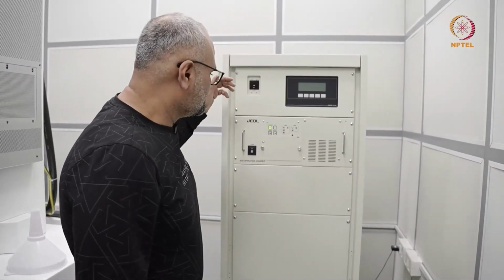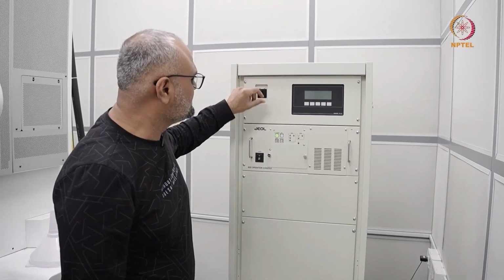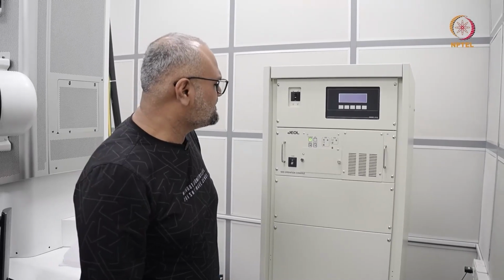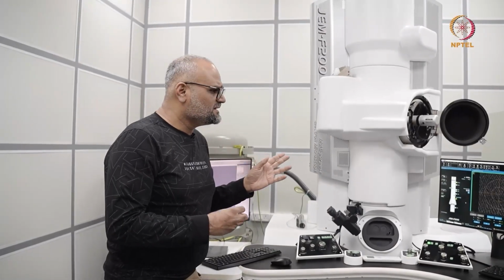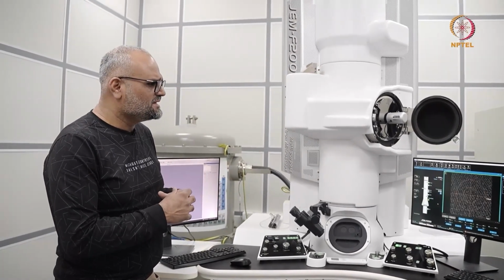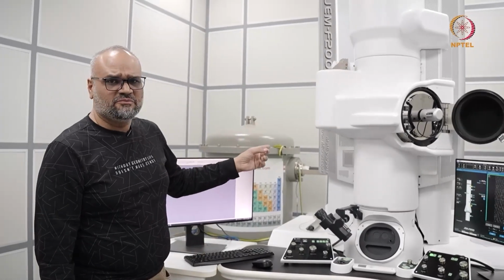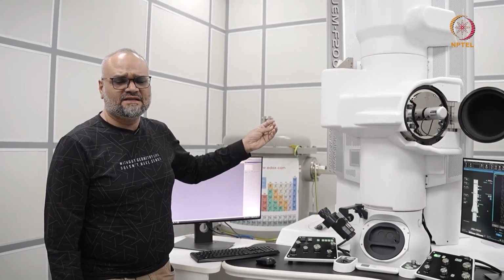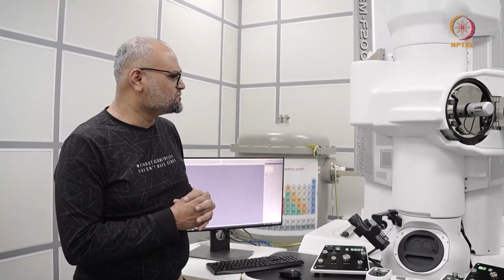Similar to the way you saw on a 2100 microscope, you can read the sputter ion pump readings here. Okay. So even this microscope has a roughing pump, which is typically a membrane pump or a scroll pump. And then this is kind of a backup pump to the oil diffusion pump. Even this microscope runs on an oil diffusion pump. Alternatively, you would have FEG instruments which also run on turbomolecular pumps as well.